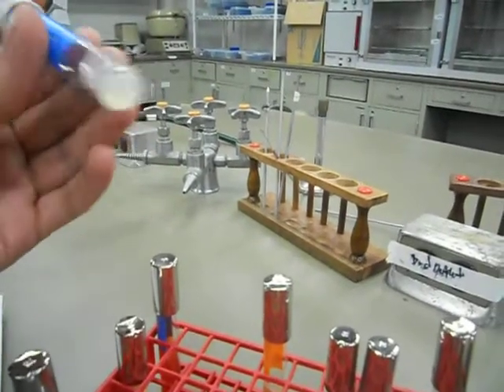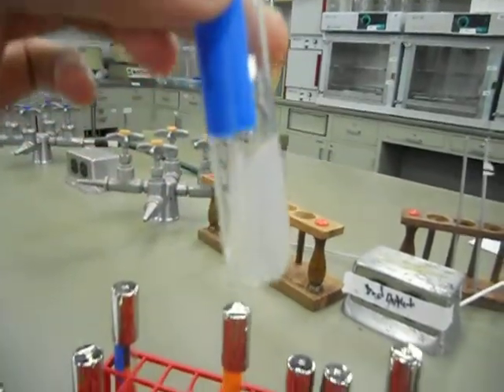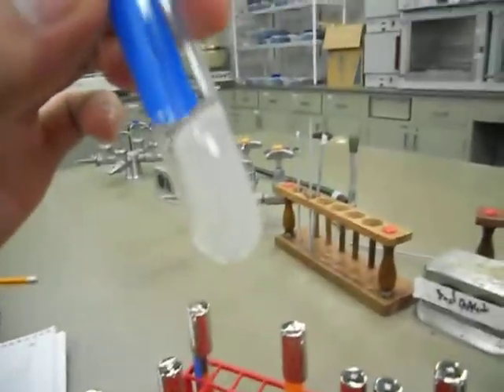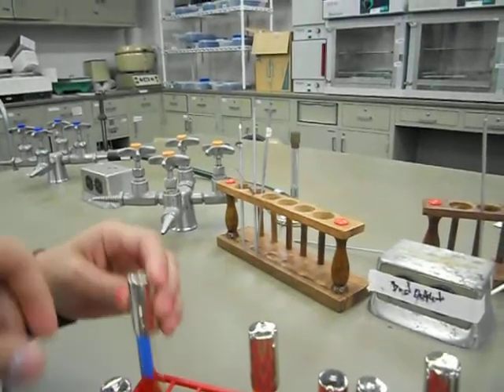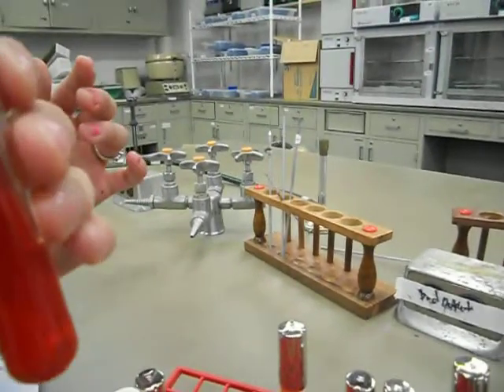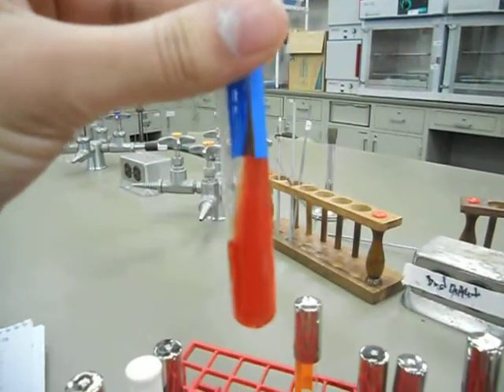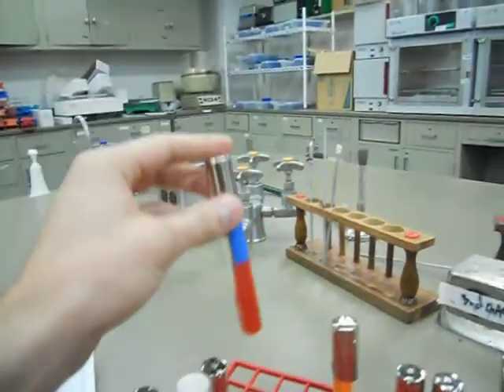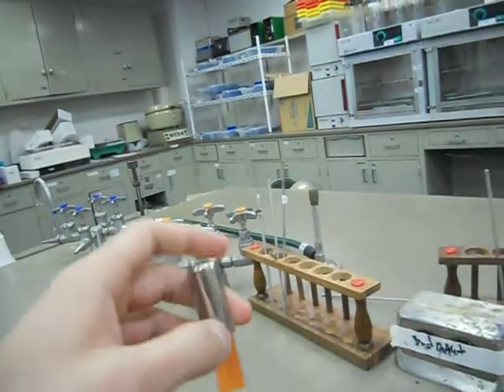The phenol red and it's a slant — this is supposed to be a slant, but it's like broken right now. It looks like a white frizzy. That's a slant. KIA — red slant, I think so. Usually the average is really low. Are you serious? Yeah, cause I remember her saying that.